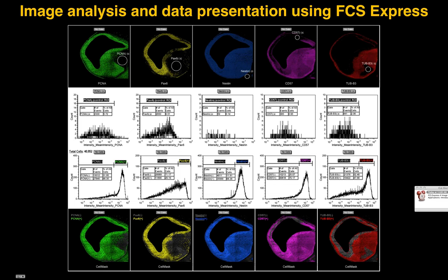And you can see this is bin data 1 and 2, so it's so sensitive that you can identify 1 cell and 2 cell bins, and draw your negative cells around. And it's even good enough if you have 50 to 100 cells to get a feeling of where the negative cells are. And then the positive cells are obviously the rest of them. And again, the idea here is to reproduce the original images from the CellProfiler segmentation, and reproduce the masked image with a specific population of interest with FCS Express.